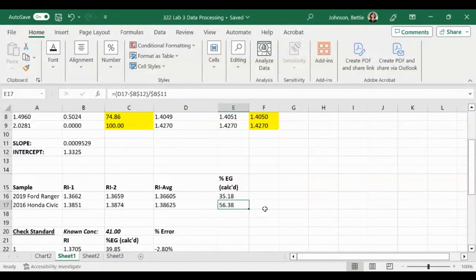Now we'd like to see how these values relate to the freezing point of this fluid. The whole point of engine coolant is to be able to lower the freezing point so that on a cold day when it's freezing outside, the actual fluid inside our engine doesn't freeze, it remains a liquid.